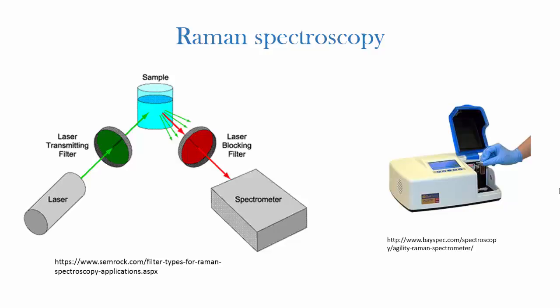If a bond is strongly polarized, a small change in its length, such as occurs during vibration, will only have a small additional effect on polarization. Vibrations involving polar bonds such as CO, NO, OH are therefore comparatively weak Raman scatterers but strong in the IR spectrum. Such polarized bonds, however, carry their charges during the vibrational motion, which results in a larger net dipole moment change and produces a stronger IR absorption band, as mentioned before.